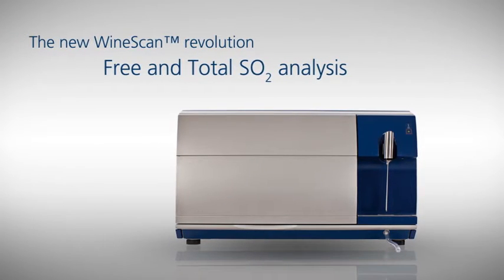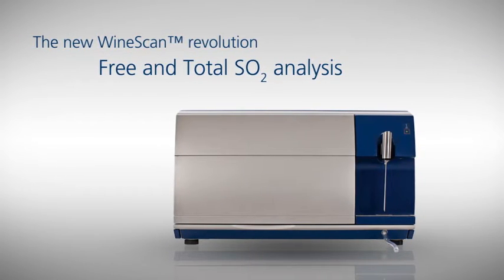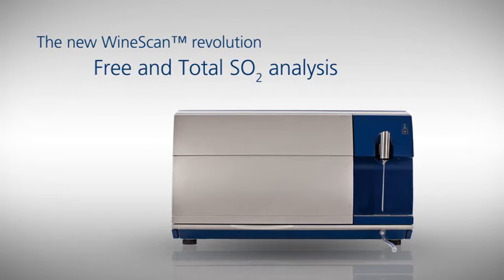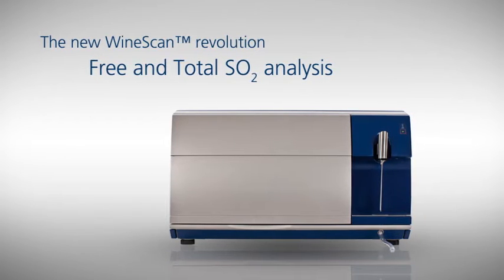Everything looks normal, but under the cover of the new WineScan, things have changed. Our engineers have integrated a new method for SO2 analysis.